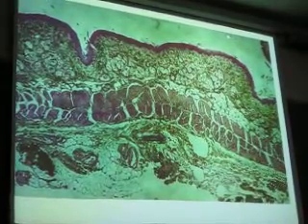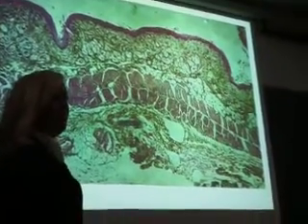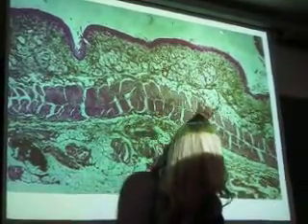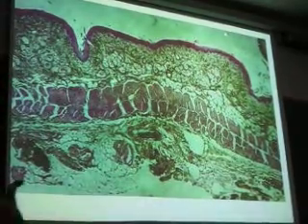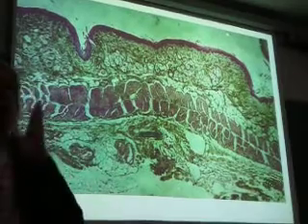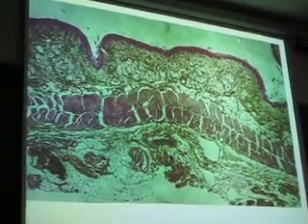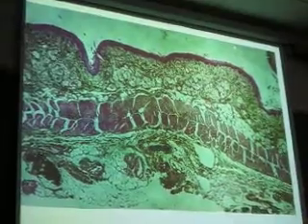Is that swath of tissue in the middle there skeletal muscle tissue? It's hard to tell what it is. Yes, absolutely. This is the muscularis externa. And you can very easily see that there are two layers, too, right? So sometimes it's not what you see, it's what you don't see. If this were stomach, there'd be three layers of muscle. So you can go through this little concept map in your brain and say, well, it can't be this, so it might be this, but I don't see this, so it can't be that. Just go through the steps. You guys know it. Don't get freaked out because you don't recognize the slide right away.